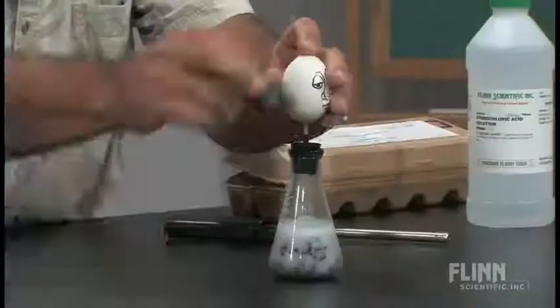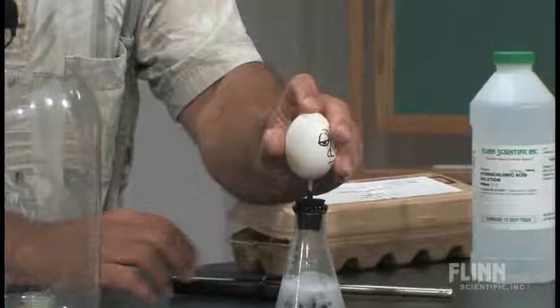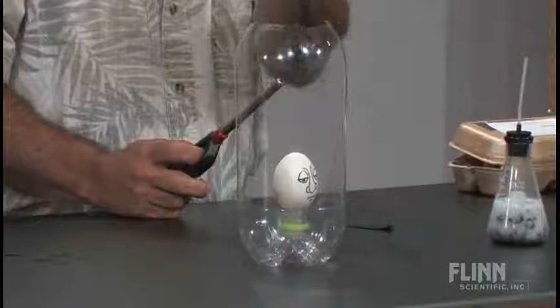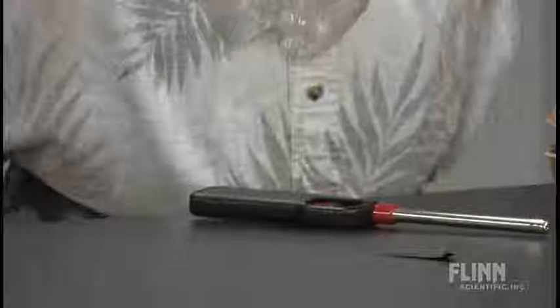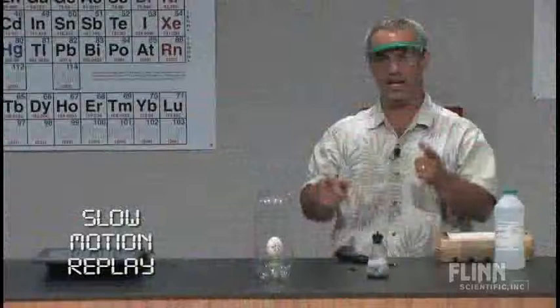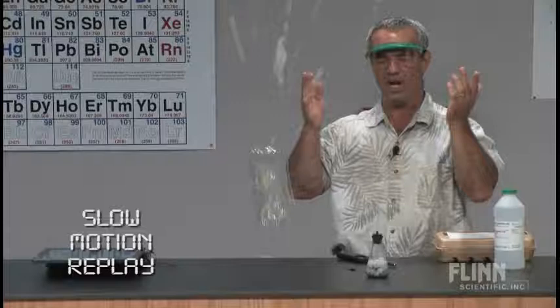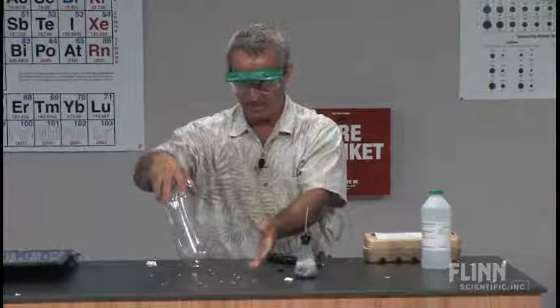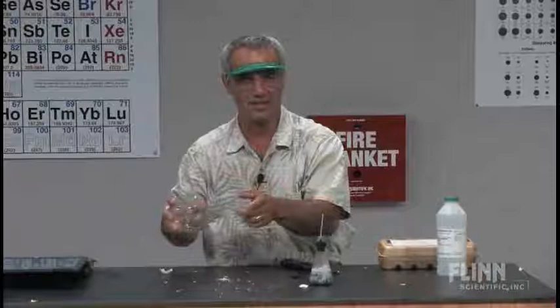So here we go. I'm going to take the tape off and put my finger over the top of it. Look at my handy little explosion shield — made of a cut-up soda bottle and a little holder. You hear a little pop? That means the hydrogen is leaking out the top hole, and you really don't see it burning that much because hydrogen burns with a nearly invisible flame. You might want to cover your ears. A little late on that one. But look at how the explosion shield managed to stop most of the shrapnel so that no one got shell-shocked. My little egg holder flew over there.